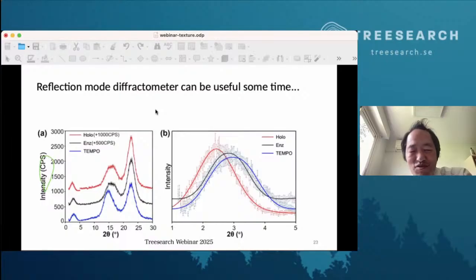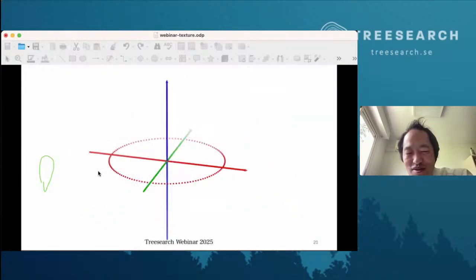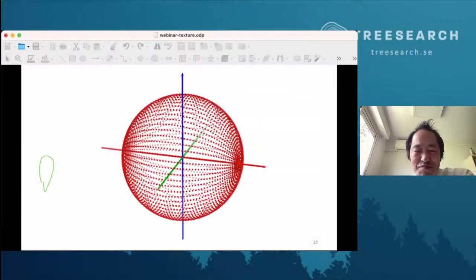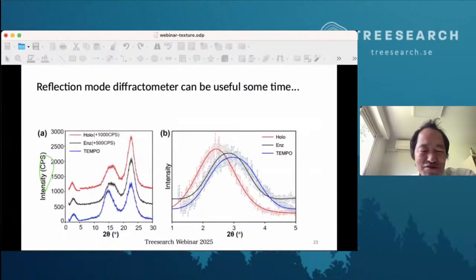And sometimes, in the same series, we also did diffractometry, because what I saw in this pattern is a strong intensity here, which I suspected comes from the continuous X-ray, because we don't have a monochromator in our X-ray system. If you go to the powder diffractometer, they are usually all equipped with a monochromator, so we can get rid of the effect.